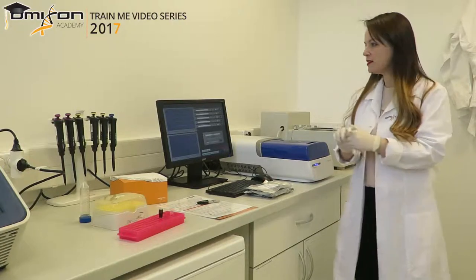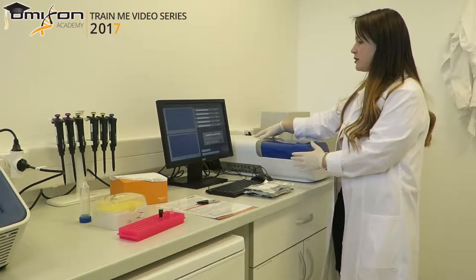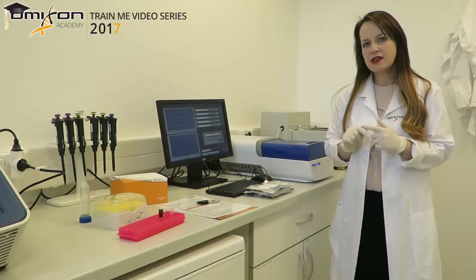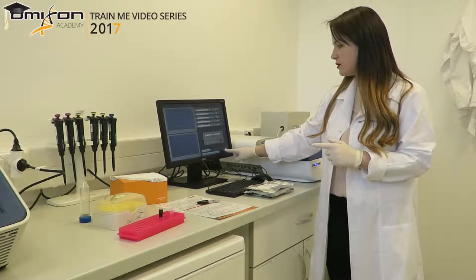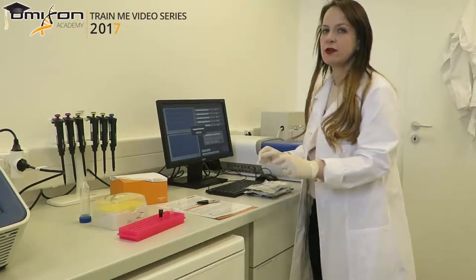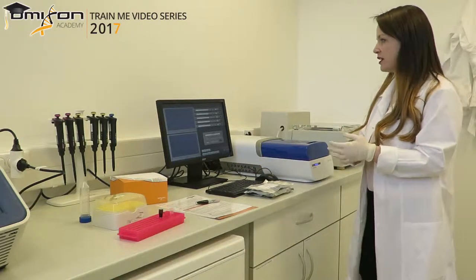We turn on the machine using a button in the back. This boots the software of the PippinPrep on the monitor. The first thing you want to do is log in to the software. To do that, click on the PippinPrep logo and put in the password, which is always Pips — P-I-P-S. It logs in very easily.